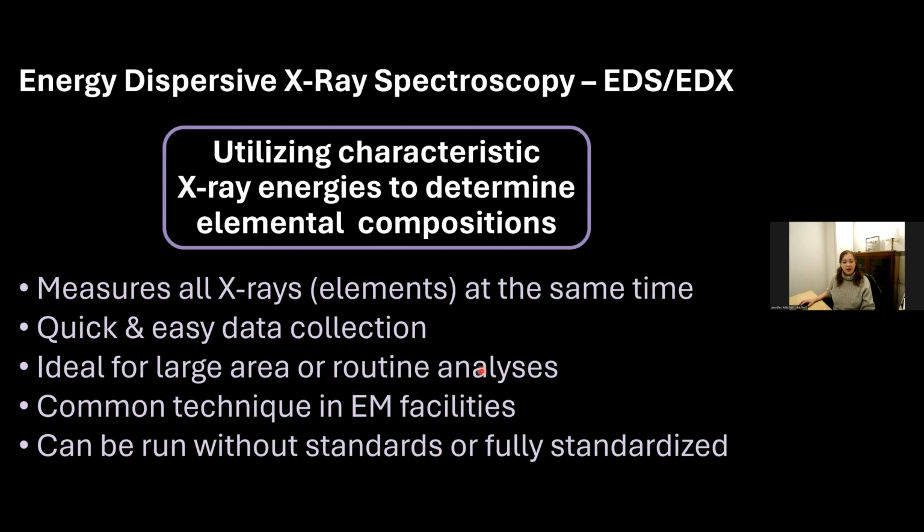As a common technique, pretty much every electron microscope facility is going to have some genre of EDS. So it's really, really available. And you can run it without standards, which is completely fine. That'll be semi-quantitative or qualitative. But you can also run it fully standardized. And this is my favorite part of EDS, is running it as a quantitative system. It can work really, really well.